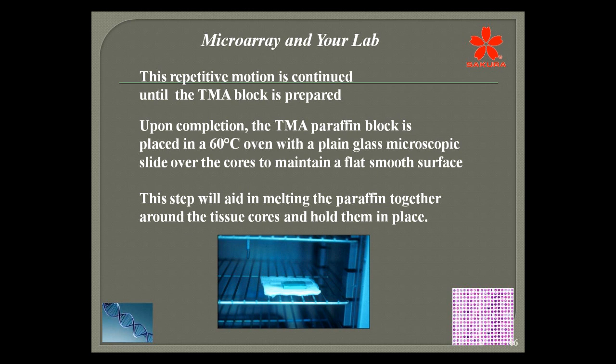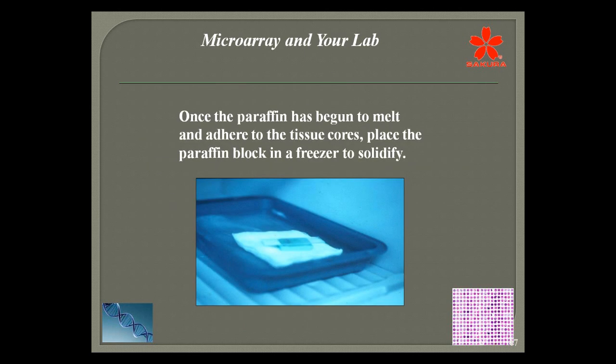You just want it to begin to melt so that it fuses together the paraffin holes and the cores of tissue so that they will remain in an upright, on-end position. So again, this is something you'll have to test in your laboratory. Just to give you a time gauge, you're probably looking at 15 minutes. I would start checking certainly after 15 minutes and determine what your endpoint will be.